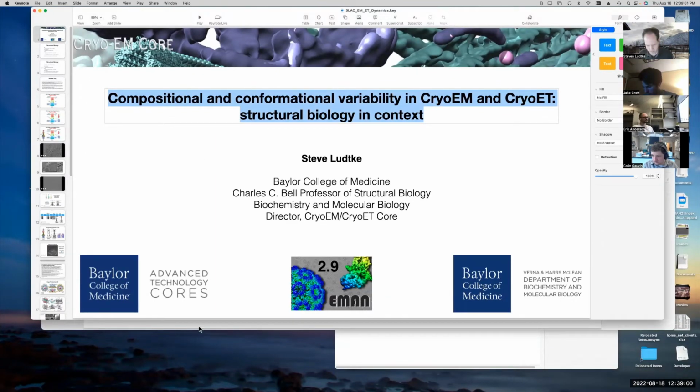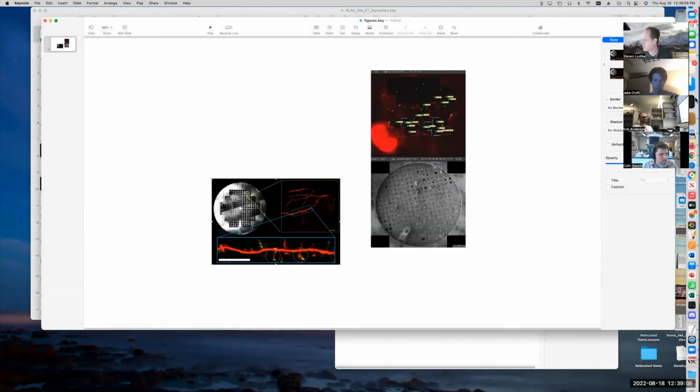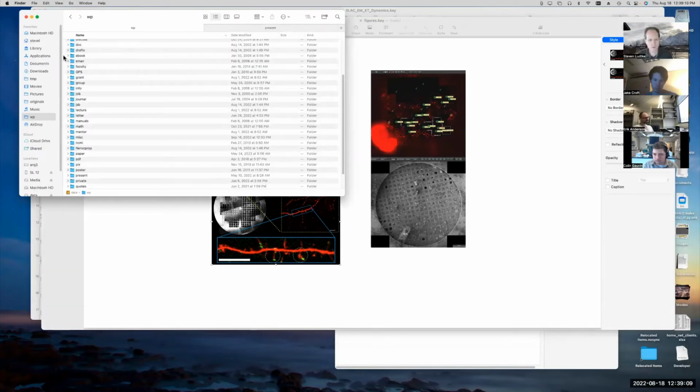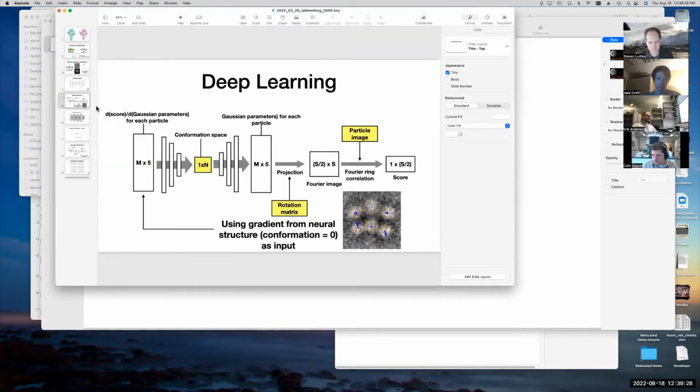Where did, oh no, lost my presentation. I recognize those images. Yeah, progress reports. Back to this again. Right, I was using that one.